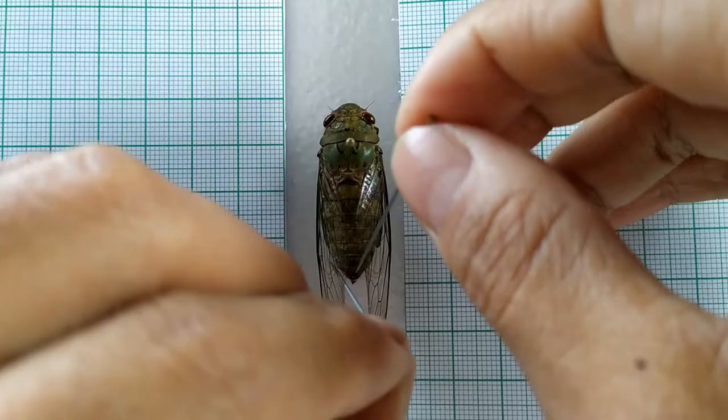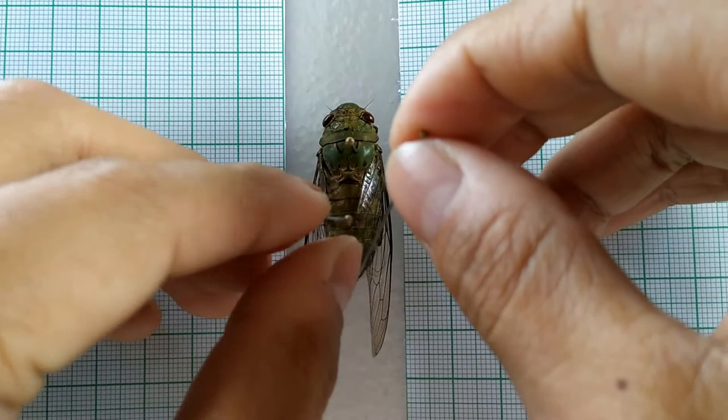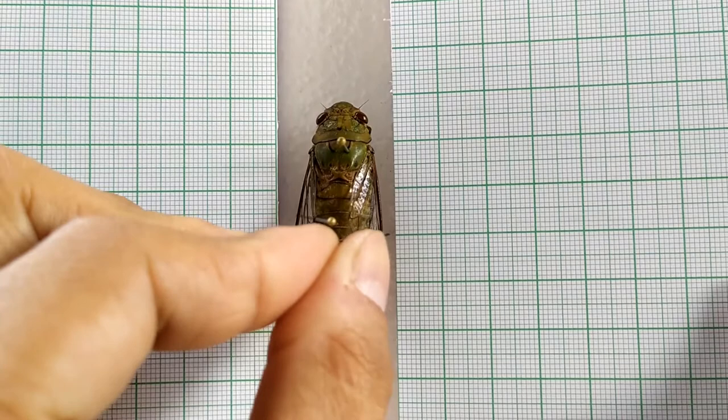Using two pins, secure and support the body of the specimen by pinning on both sides of the abdomen. The specimen is now ready for spreading.